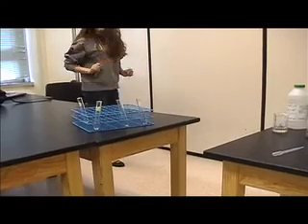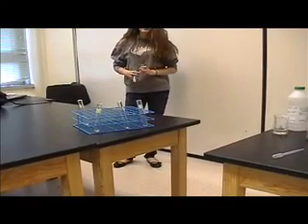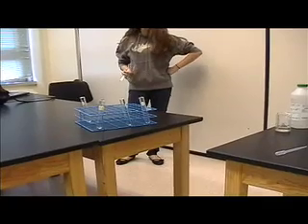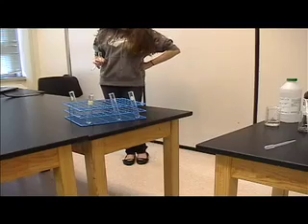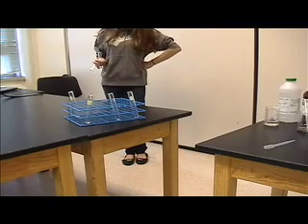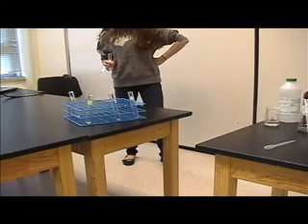Oh hello, I didn't see you come in. Now today we're going to be testing for six different types of anions. But what is an anion, you may ask? Well, an anion is a negatively charged ion that is attracted to an anode during electrolysis.